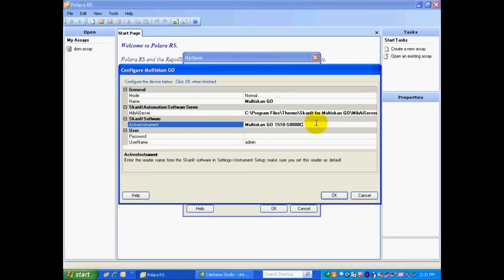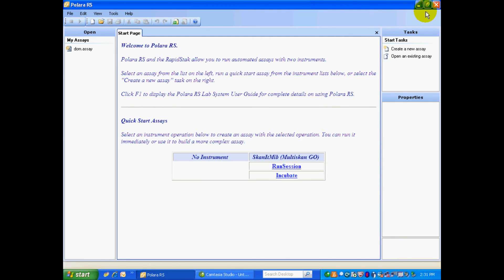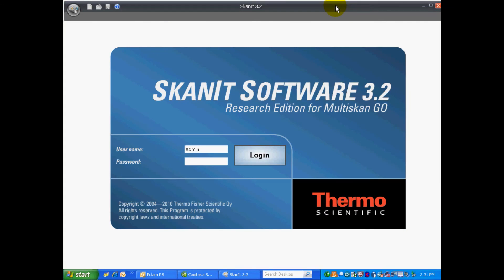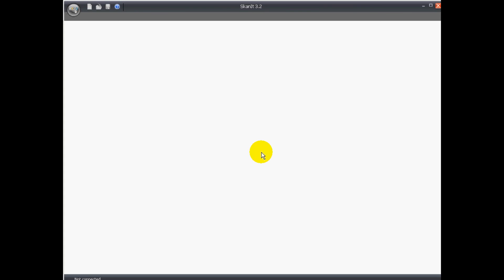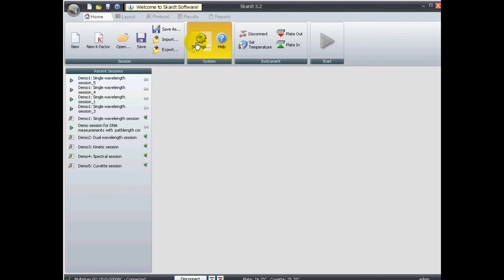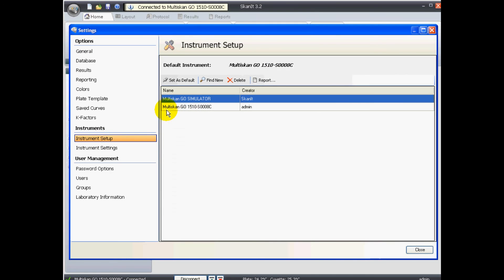Now, you also have to make sure that you put in the proper name of the active instrument. And if you click on this box of the active instrument, you'll see in the notation, enter the reader name from Scanit Software in Settings, Instrument Setup. So, we'll go and see what that is right now. We'll just minimize this. Open up Scanit for the Multi-Scan Go. Wait momentarily while the Scanit opens up. And if we go into Settings, Instrument Setup, you'll see here that the Multi-Scan Go 1510-S0008C is the name. So, if you just write that down and insert it into Polara RS, you're all set.